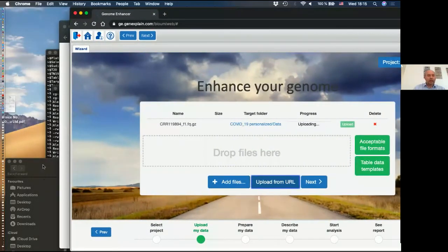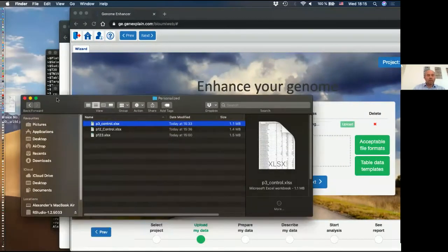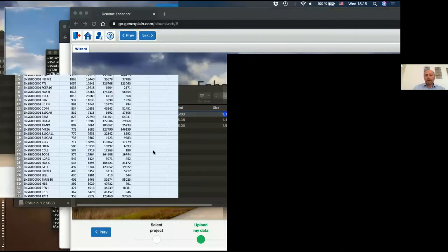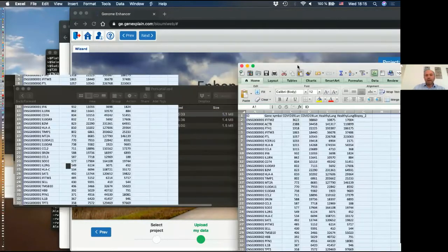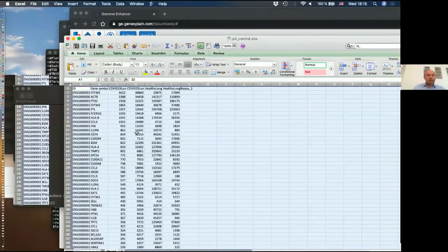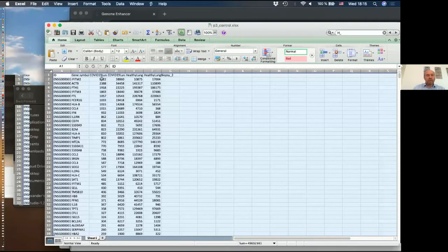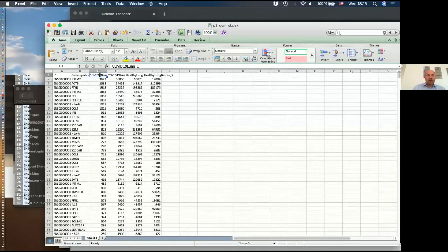But the second dataset was already published in the form of counts. This is patient number 3, published as count data. Here is the Excel table with this data from patient 3. Again, 2 replicas were done, and 2 healthy biopsies were done as controls.